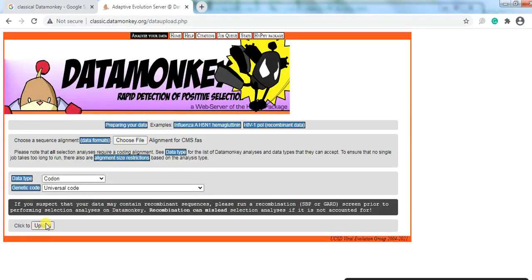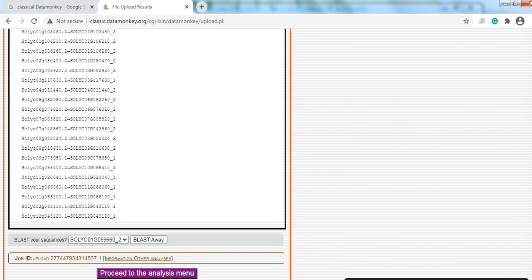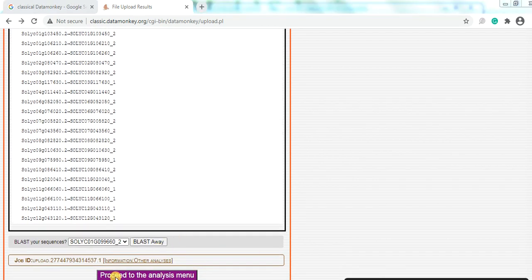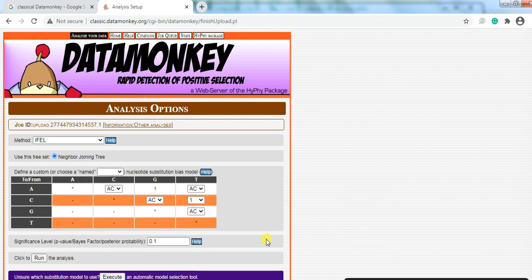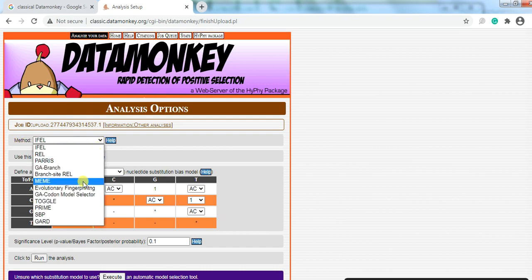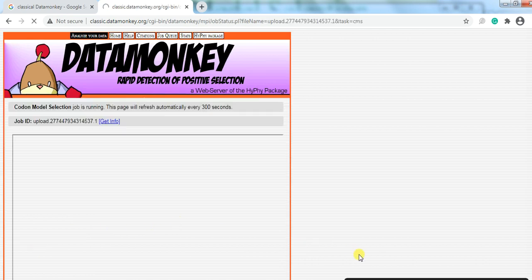Click Upload. It will give you upload options. Then click 'Proceed to the Analysis Menu'. When you click on it, you will get an analysis window. From the method options, choose GA Codon Model Selector and click Run.